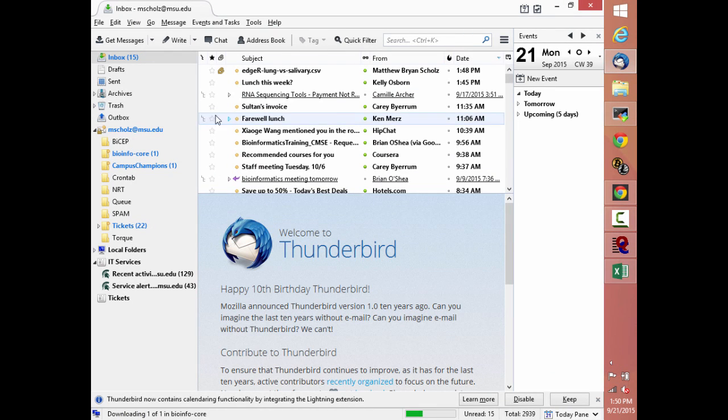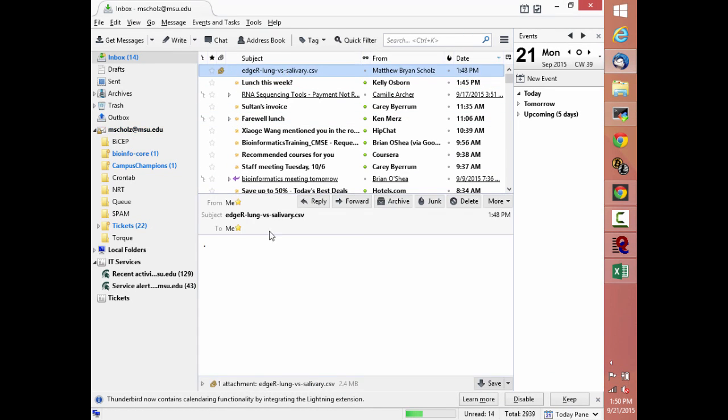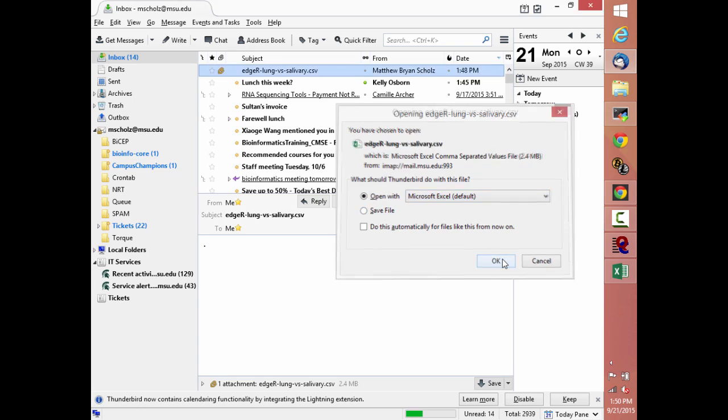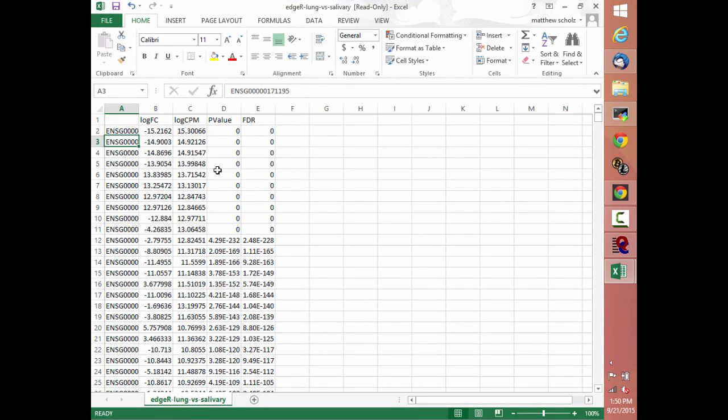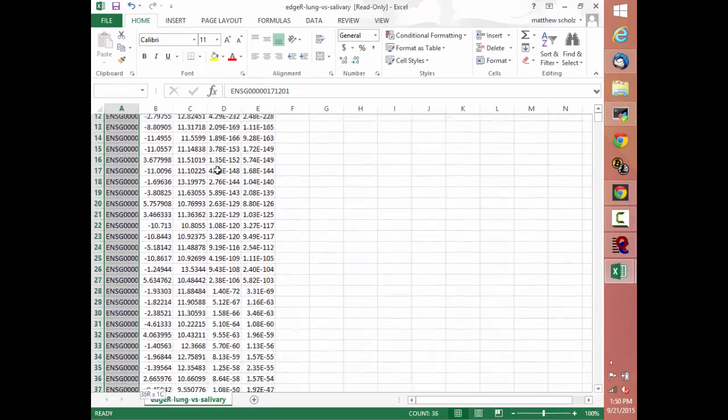The way that they go about it in this tool is, I'm going to take all of these and we're going to see what it gives us, and then we can figure out why it's doing it.